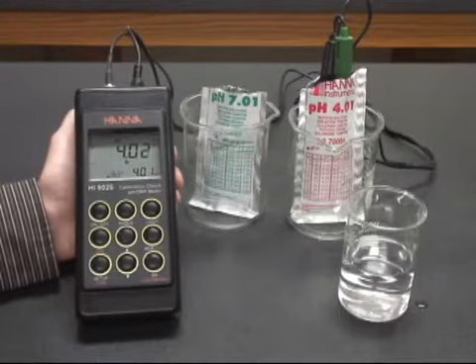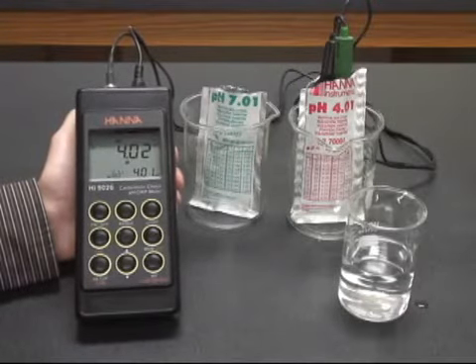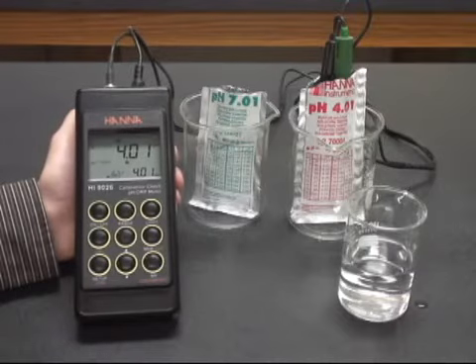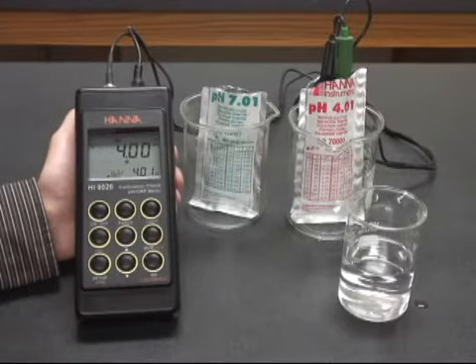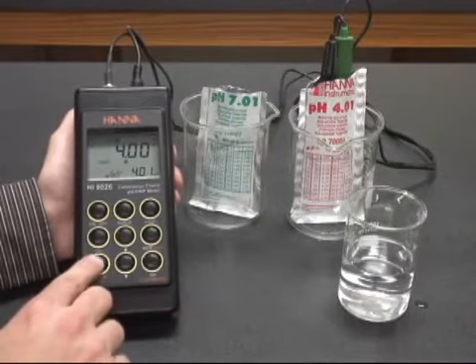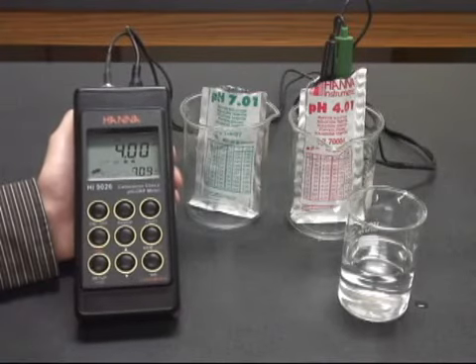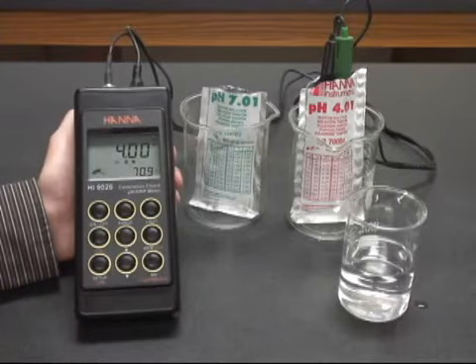And you'll see the procedure repeat as it asks you to confirm the 4.01 buffer after just a few seconds. You hit confirm again. You'll see your meter move into measurement mode, displaying the temperature and you're good to go. You are now ready to measure pH.